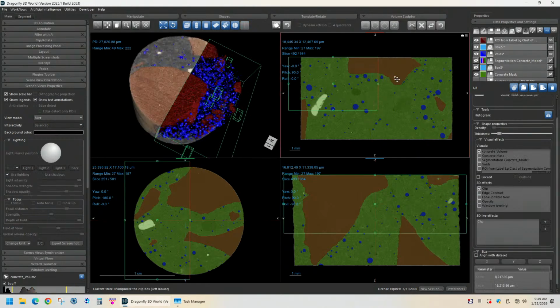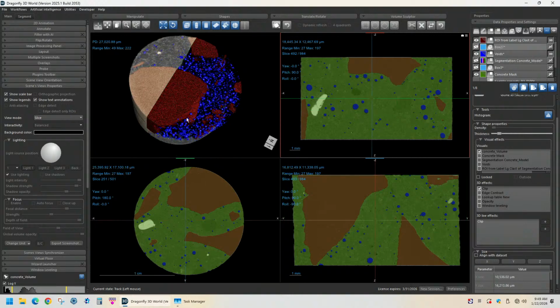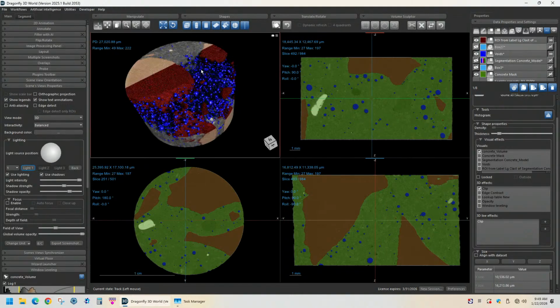All right. So I think that was all the stuff we wanted to do, right? Yeah, so now we're getting to the spot where we have some really cool images. The only thing I will say, we did talk about in the last episode, going into this and creating your multi-ROI and doing the compute measurements so you can get your volumes, you can get your quantitative analysis.